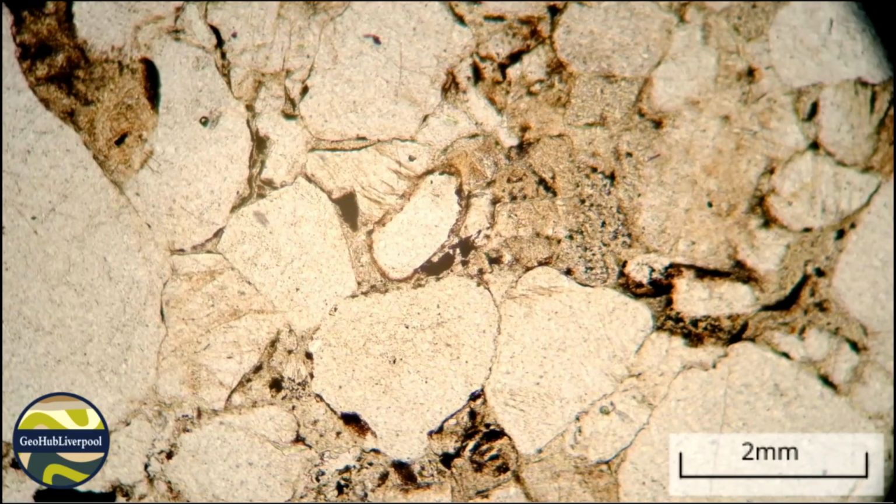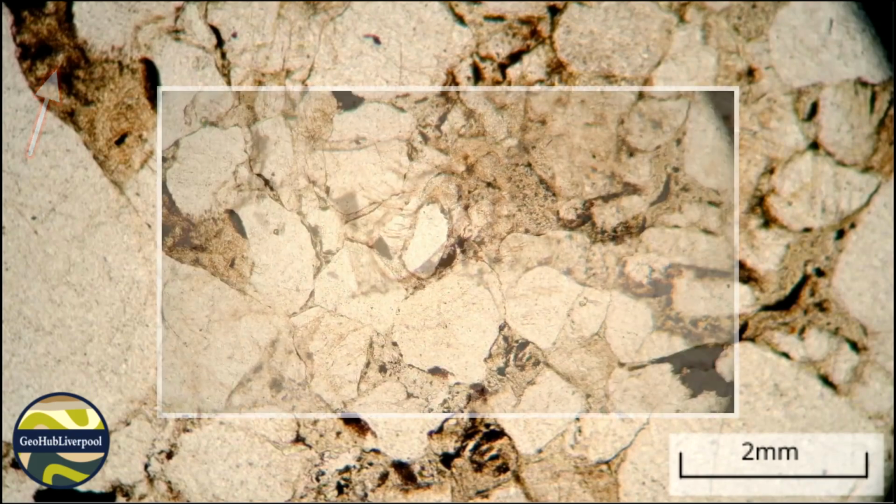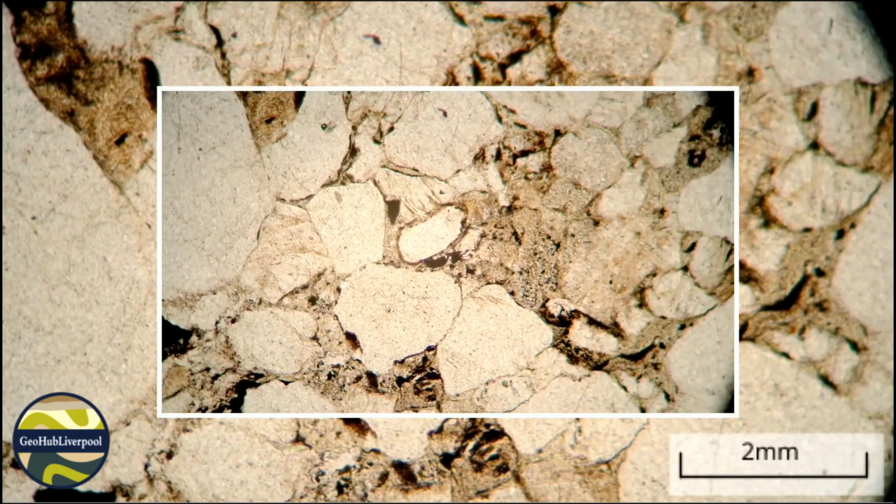In plain polarised light, the grains in this thin section are colourless and have low relief, which means that they don't stand out from the section. It's hard to tell them apart, but some grains have a slightly cloudy or turbid appearance, and a few show faint traces of cleavage. There are also patches of darker, turbid material in the spaces between some of the grains. When the stage is rotated, there is no change in the colour of the grains.